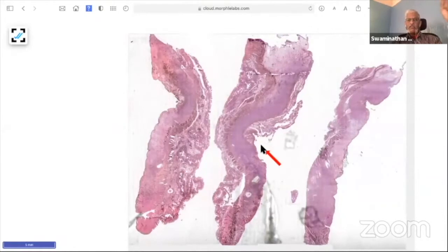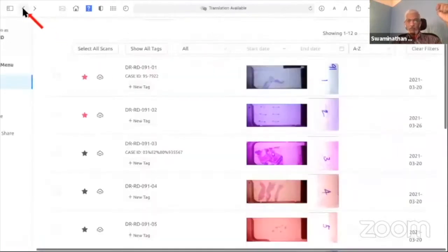And the second thing is what causes it. Is there any thrombus in the mesenteric blood vessels? Very, very important. You have to look for any thrombus here. And if there is any thrombus, it should be away from the ischemia, because the ischemia itself can cause thrombosis. Whether ischemia is causing the thrombosis or thrombosis is causing the ischemia is the question you have to ask. So that is slide number 4.